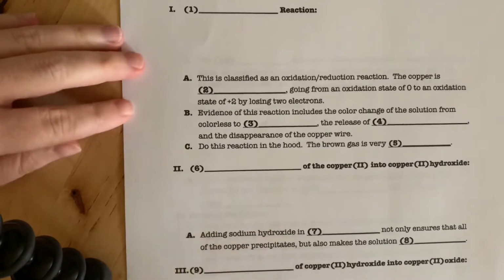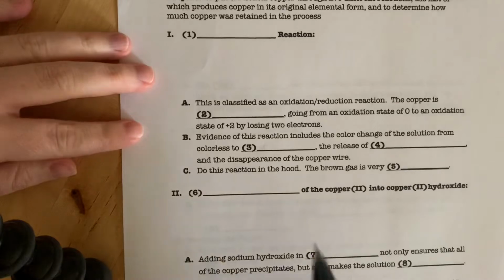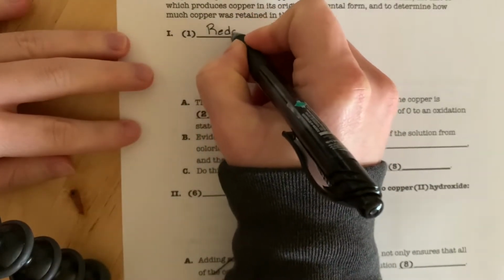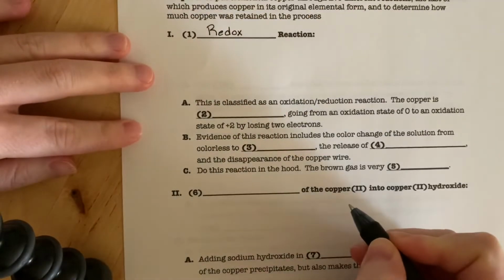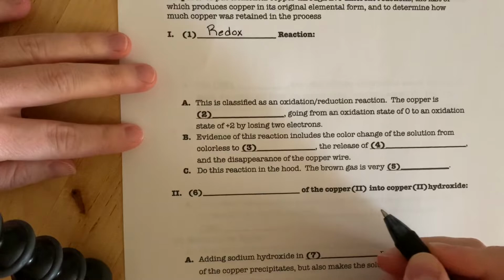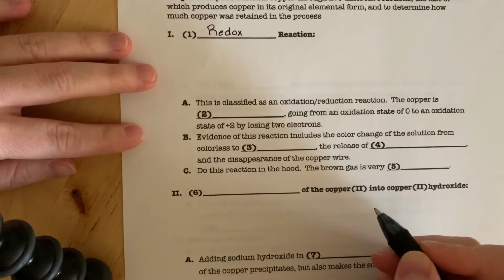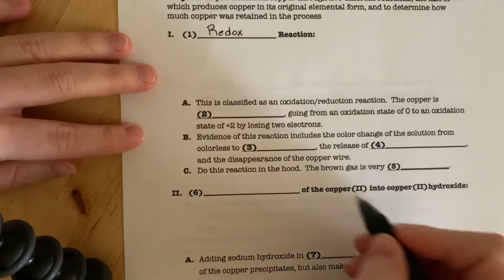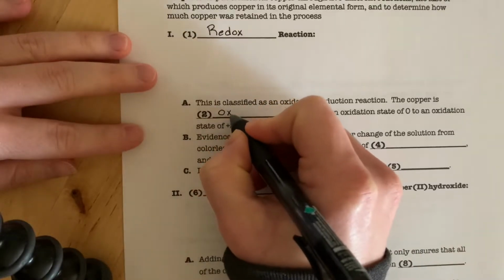So the first reaction that we're going to observe is a redox reaction. The copper is going from a 0 oxidation state or charge to a 2+ charge. So it is oxidized.